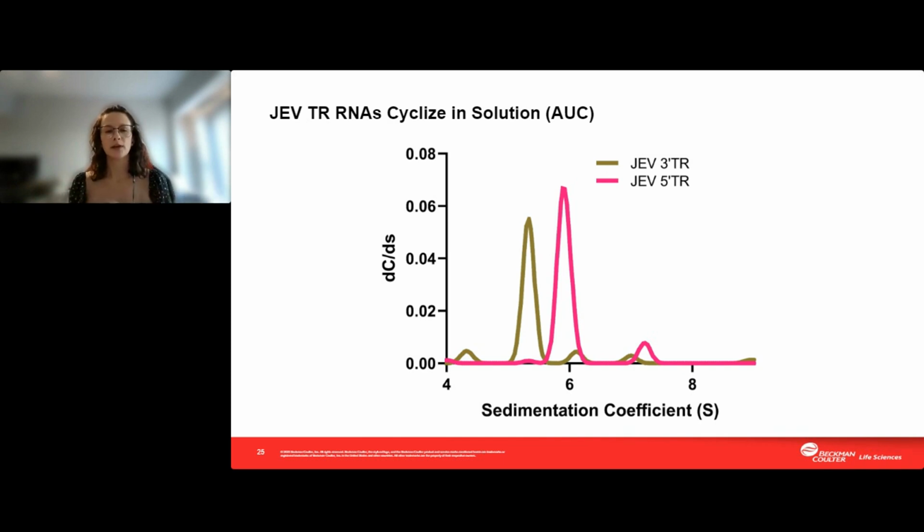And we found that if you add urea to your RNA sample, heat it up, and then measure it in the AUC inside of that urea, you can get a single peak if your RNA is pure. And that can help you to identify if your RNA is pure or not. It's kind of like doing a urea PAGE inside of an AUC, but it helps to tell you if it's just folding structure that's causing those different sedimentation coefficients, or if you have contaminants in your RNA prep.